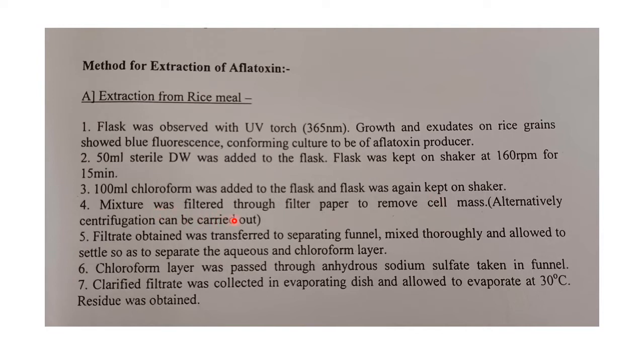The mixture was filtered through filter paper to remove the cell mass, or alternatively you can centrifuge. A simple way is to filter using filter paper, but you should be careful because it is a toxin. Wear your hand gloves, mask, and work properly.